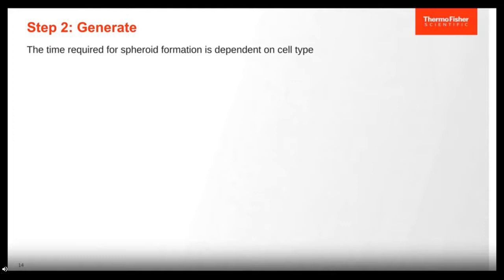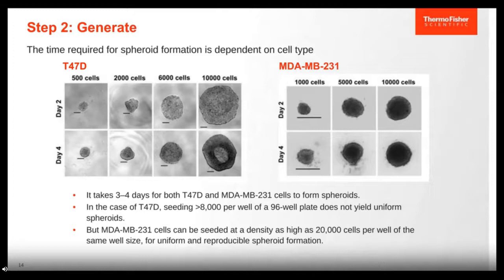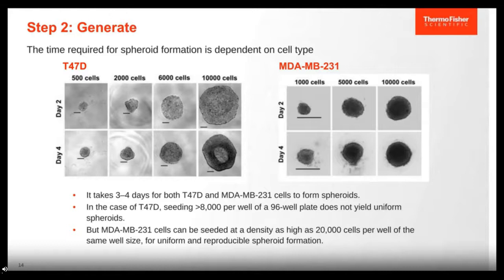Depending on the cell type chosen, spheroid formation may differ. For the two breast cancer cell lines — T47D and 231 — it takes both about three to four days to form spheroids, but they look visually different. For the T47D, it was noted that going above 8,000 cells per well does not yield a uniform spheroid — at 10,000 cells per well, by day four you see a really dark necrotic core forming in the middle. The 231 cells, by contrast, can go up to 20,000 cells per well in the same time frame and still yield reproducible spheroids.